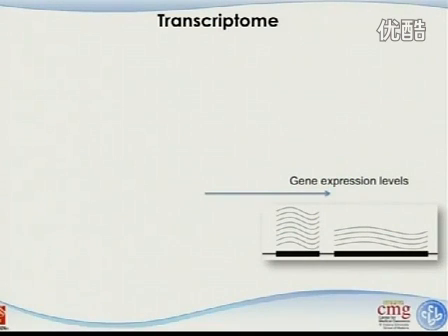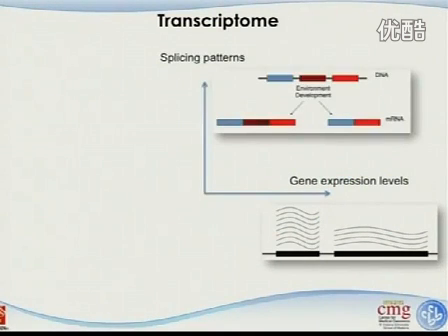However, the transcriptome is really not one-dimensional. The second dimension is splicing variation. You can see that this is one gene with 3 exons, and splicing occurs where the intronic regions are spliced out. In one biological condition, the middle exon has been kept in the final product, and in the other one it has been spliced out. So this one gene eventually becomes two different isoforms, and the question is whether we have the technology to measure that.